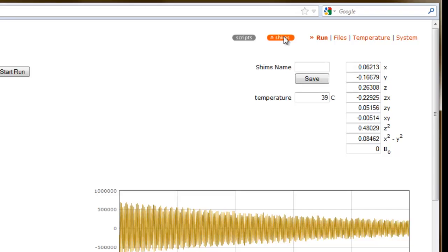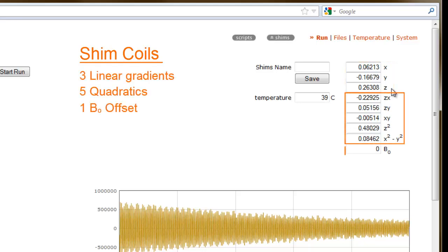The parameters on the right-hand side are normalized shim coil current values. The picospin capillary cartridge has nine shim coils: three linear gradient coils, five quadratic coils, and a B0 offset field.